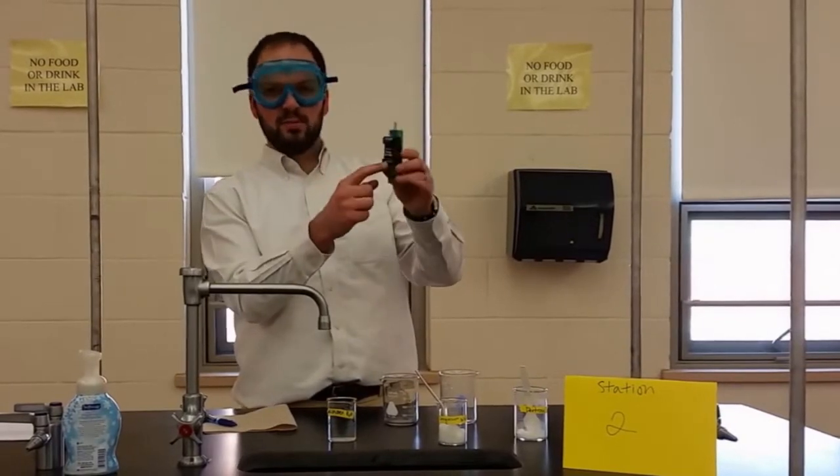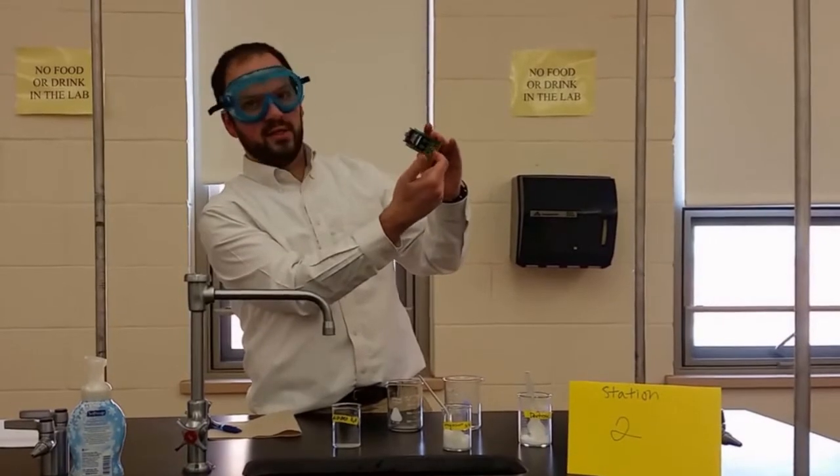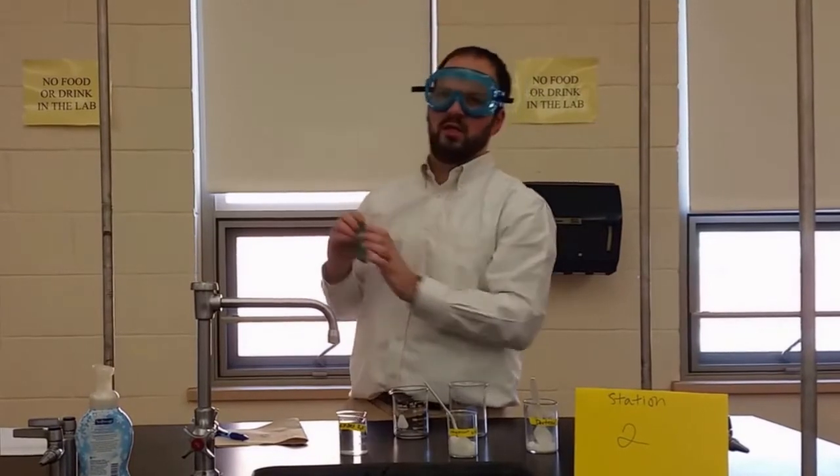This has a battery that's hooked up to terminals. It has a switch. You've got to make sure the switch is on. And it has 2 lights. And the way that these lights are lit up is explained by a key on the back that tells you how conductive the solution is.